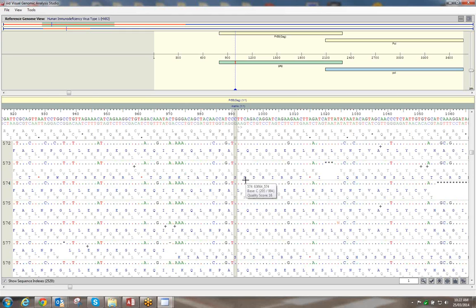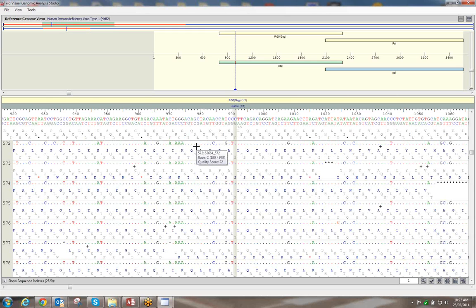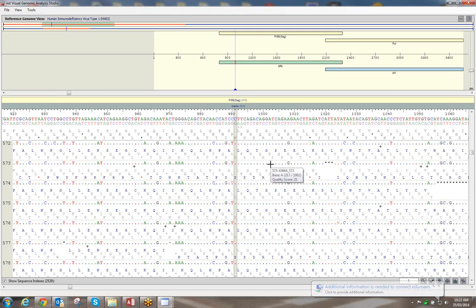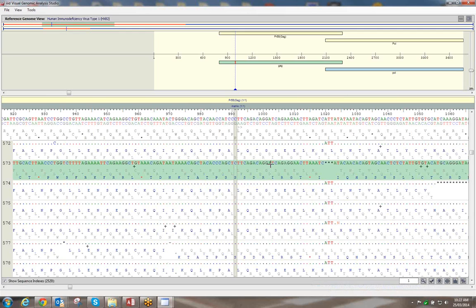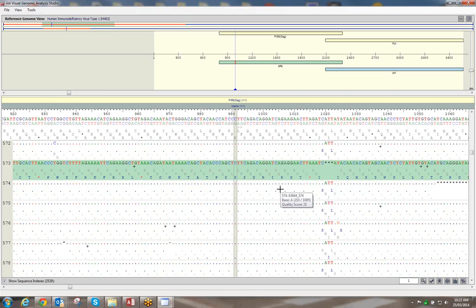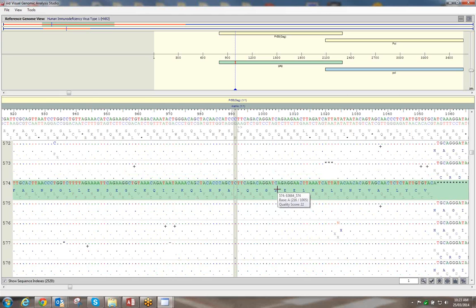You've got conservation — you can view nucleotide conservation or amino acid conservation. If you click one of them it shows the conservation against the reference. Anything with a dot matches the reference sequence. If you single-click on one of the sequences it selects that sequence, and then the conservation is shown against that selected sequence. You can also do amino acid conservation.